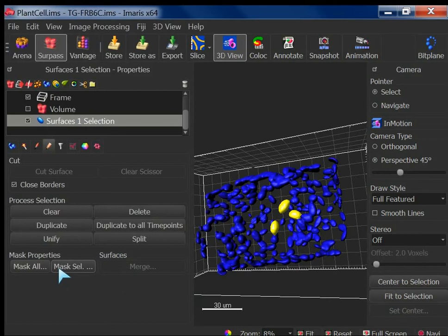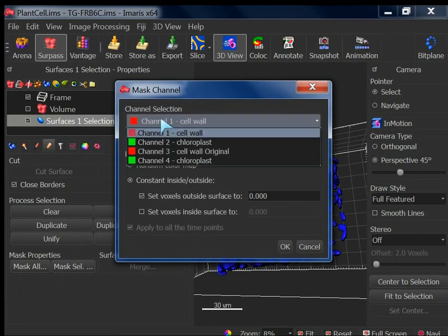Then I can go here. So you put the surface selection. I'm just a bit confused with the channels and stuff. So no, the channel has nothing to do with that. Right. Okay. So it's from the surface. Yeah. Because see, whatever you do here is only for visualization. It has nothing to do with the statistics. The statistics will come from the channels we already have. Okay. And then you go here and then you can select all the channels.